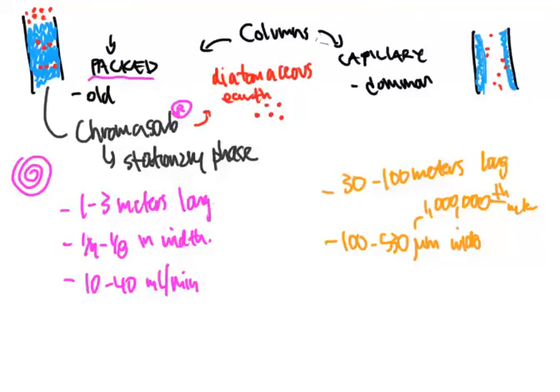100 meters. That's crazy talk, right? I mean, imagine the distance between the floor to your waist and then multiply that by 100. And this thing is curled up on the inside of the machine, and that's what your sample will travel through. Super, super tiny in width, but super, super long in length.